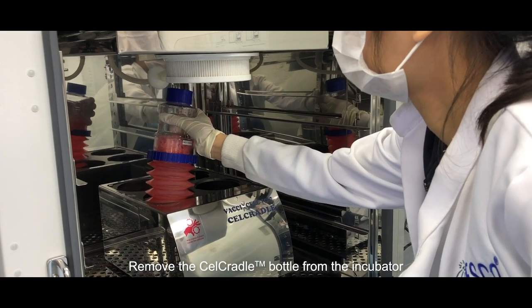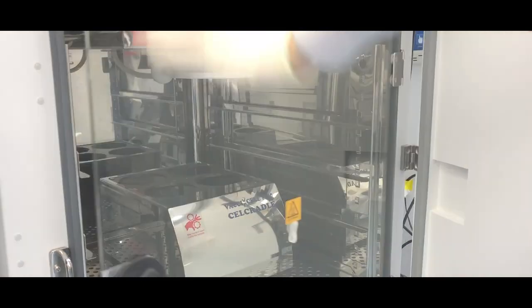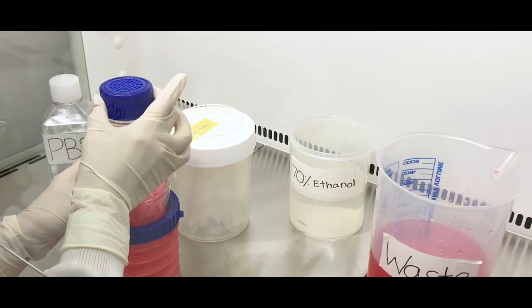To start off, remove the cell cradle bottle from the incubator. In the biosafety cabinet, uncap the bottle and place the blue vented cap into the petri dish to ensure sterility.